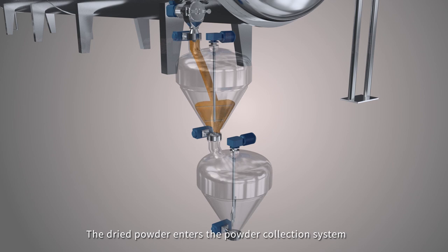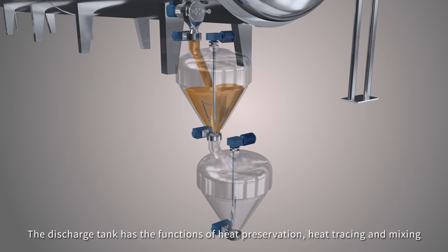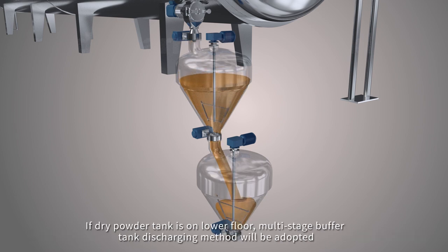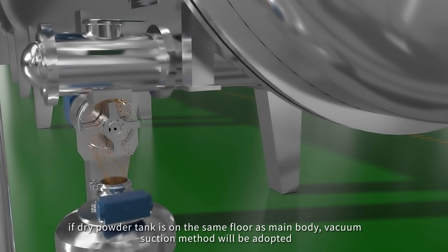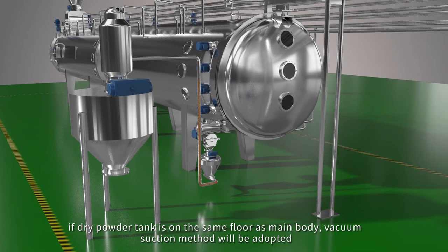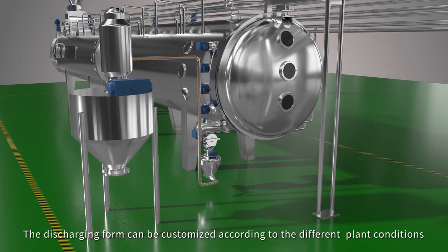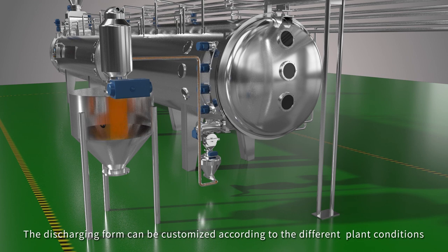The dried powder enters the powder collection system. The discharge tank has the functions of heat preservation, heat tracing, and mixing. If dry powder tank is on lower floor, multi-stage buffer tank discharging method will be adopted. If dry powder tank is on the same floor as main body, vacuum suction method will be adopted. The discharging form can be customized according to the different plant conditions.